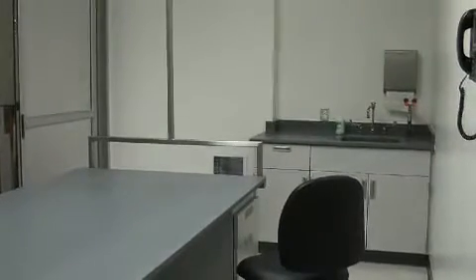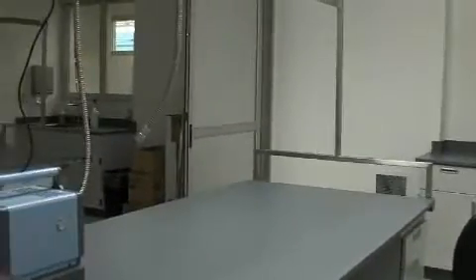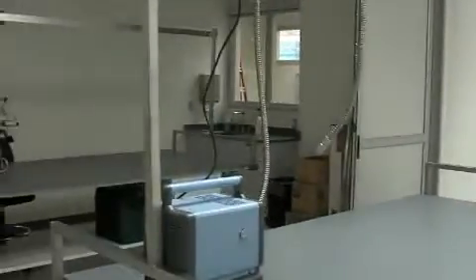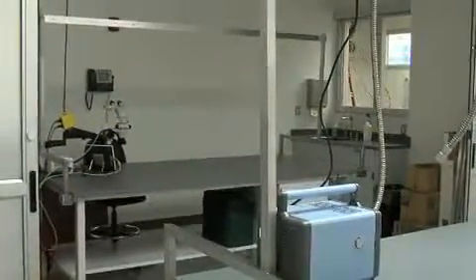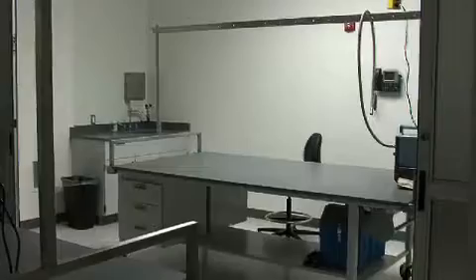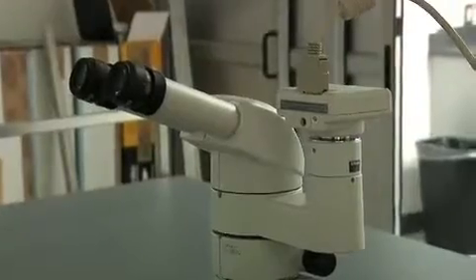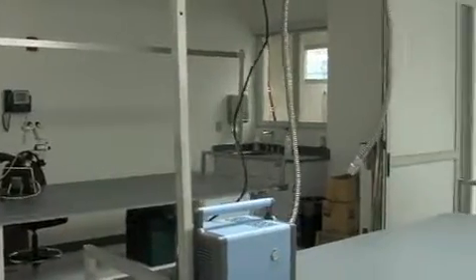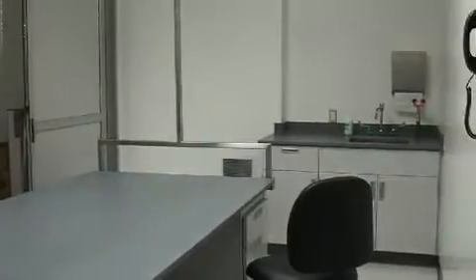The advantage of this over our prior space is that it gives us 4 search rooms, 3 more than what we had previously, but it also allows us, once we open up the doors, to move these 2 tables together and actually be able to look at a very, very large item. Beforehand, if we were looking at something like a California king-size sheet, that's a very large item, and to put it on one table, you'd actually have to fold it and kind of do sections at a time.